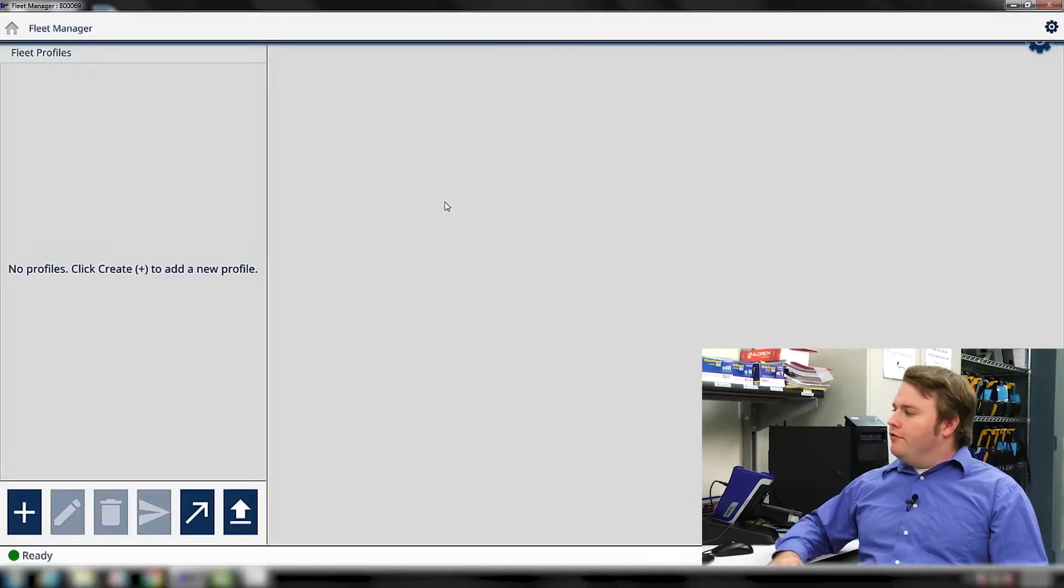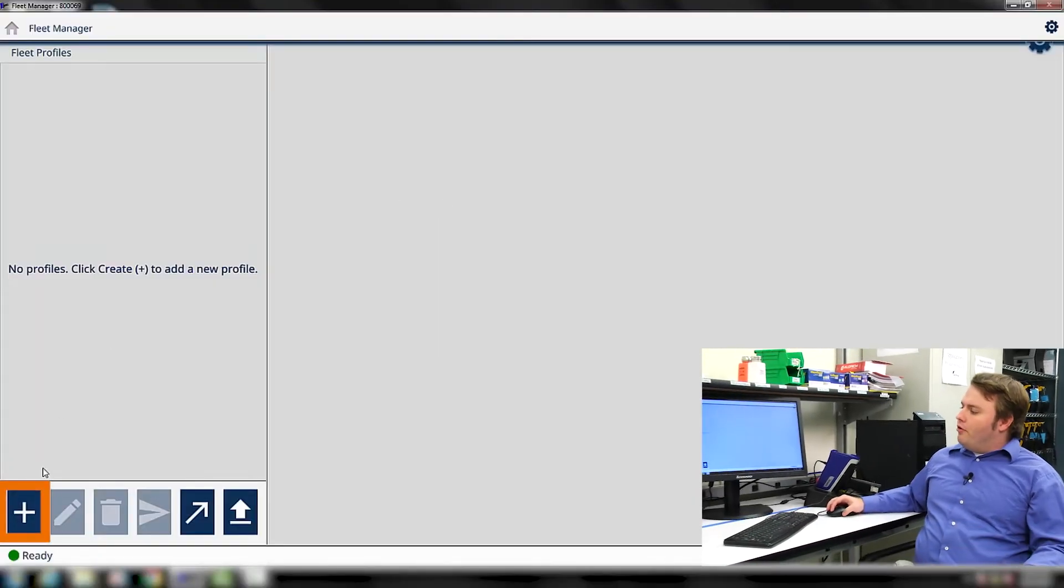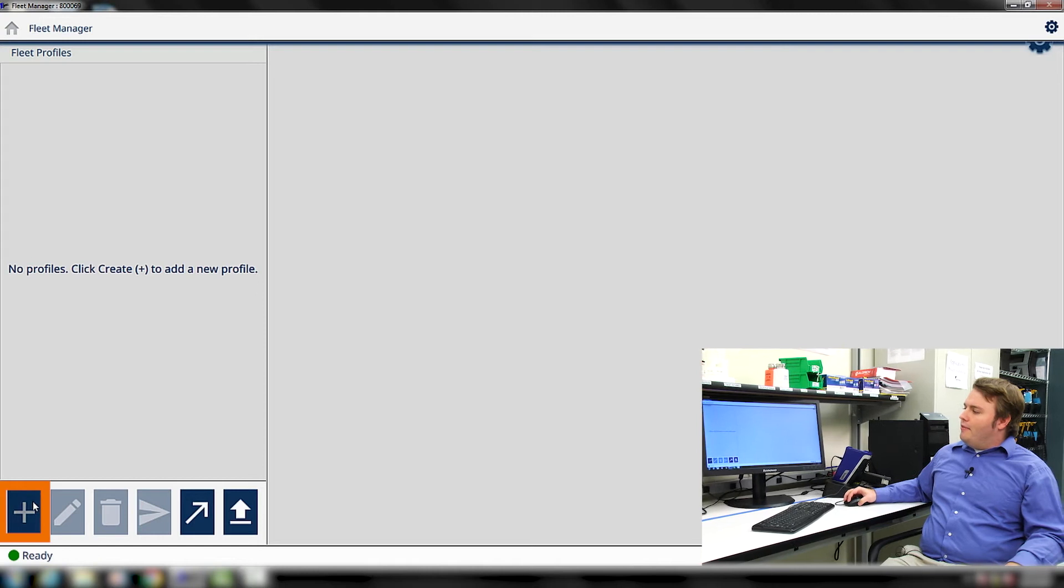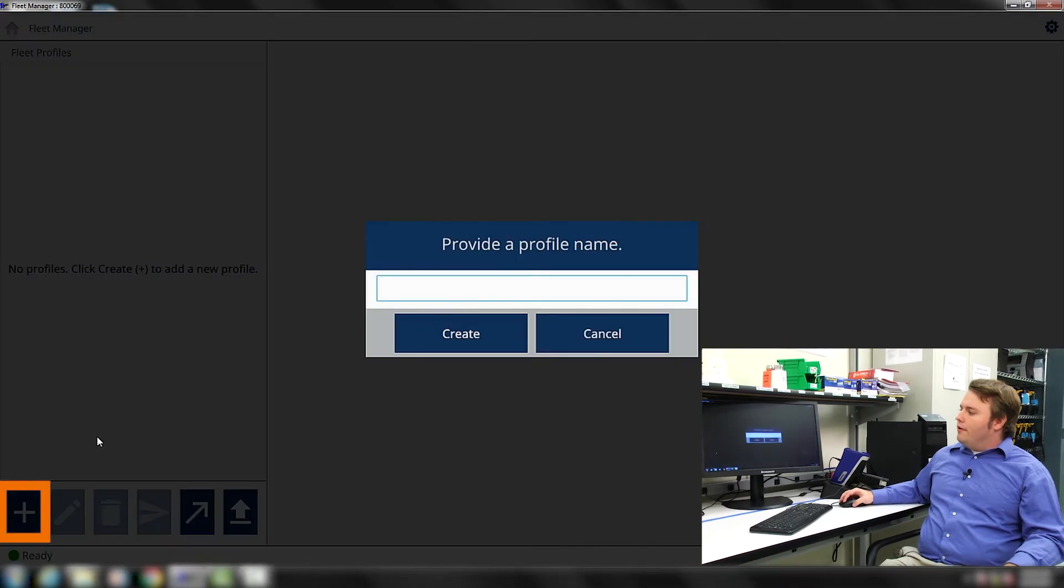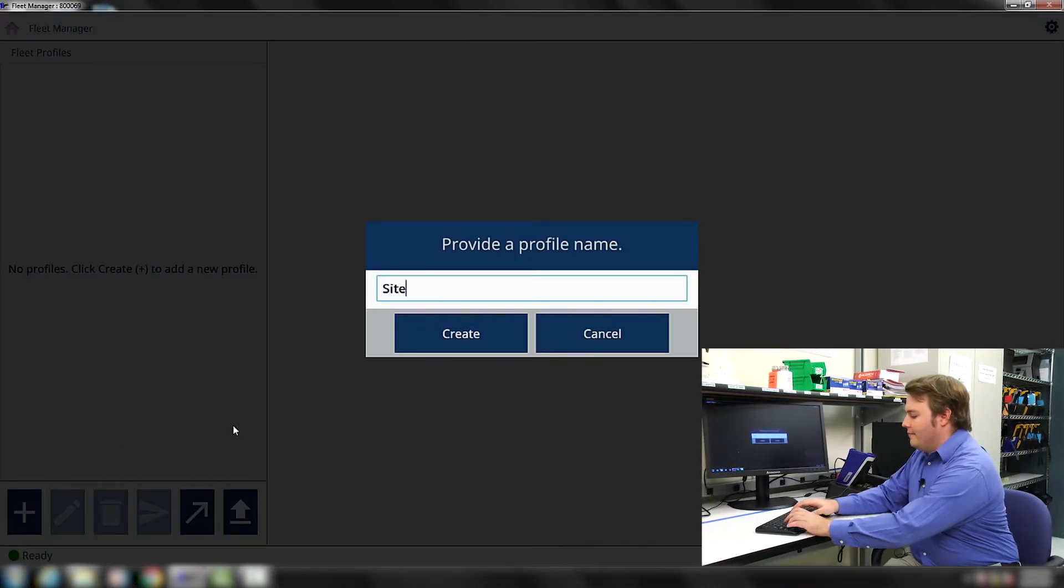Let's start off by creating a new Fleet Profile. You can create a new Fleet Profile by pressing the plus icon in the bottom left-hand corner. We're going to call our Fleet Profile Site A.